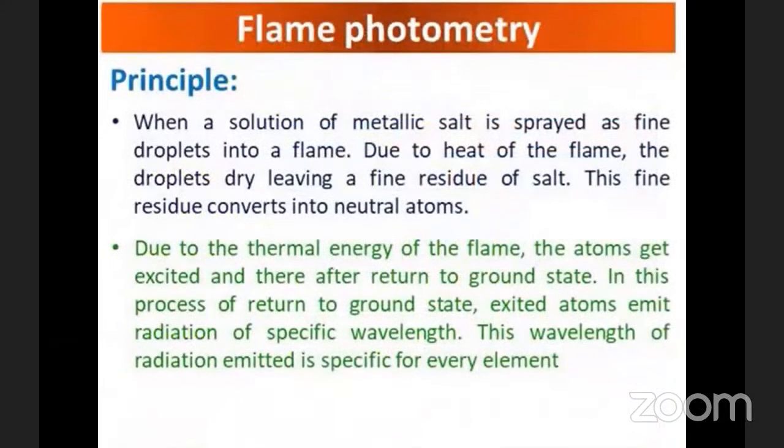Let us see the basic principle of flame photometry. When a solution of any metallic salt is sprayed as fine droplets into the flame, due to the heat of the flame, the droplets dry, leaving a fine residue of salt. This fine residue converts into neutral atoms.